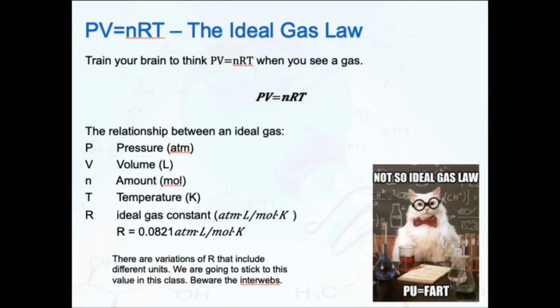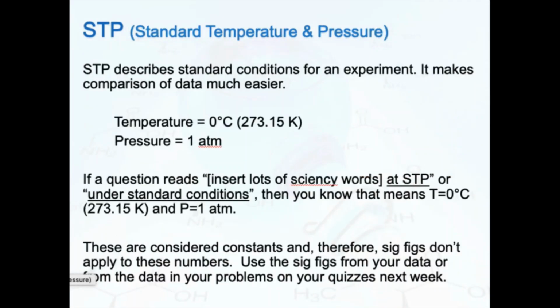So I was talking earlier about wanting to use 1 atmosphere in experiments. There is something called standard temperature and pressure, and that describes the standard conditions for an experiment. When you're reading someone else's study and trying to figure out if you've done something similar, or you want to set up your own experiment like that, if they've used standard temperature and pressure, you know that you're good to go and how to set it up.